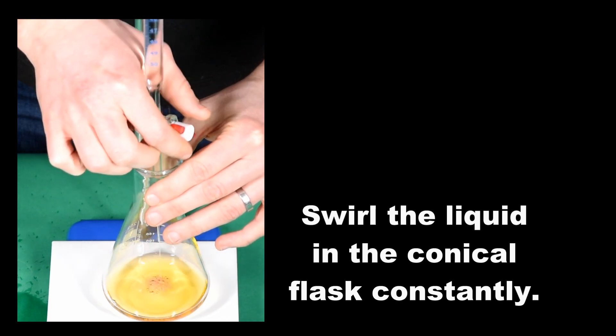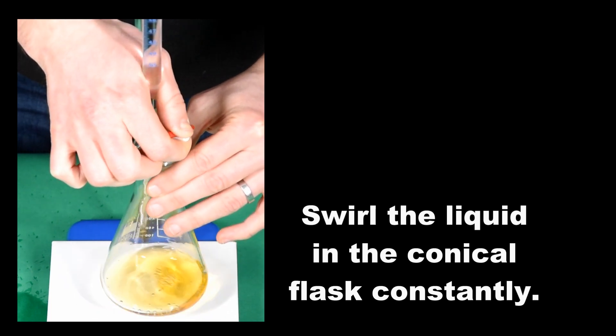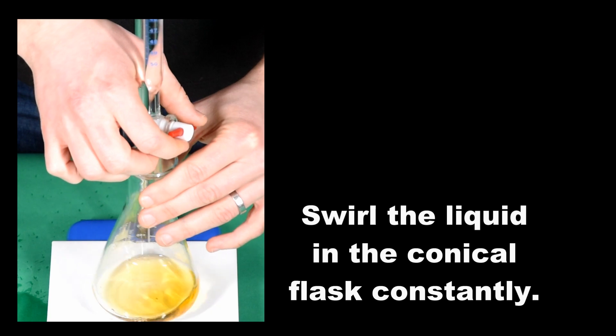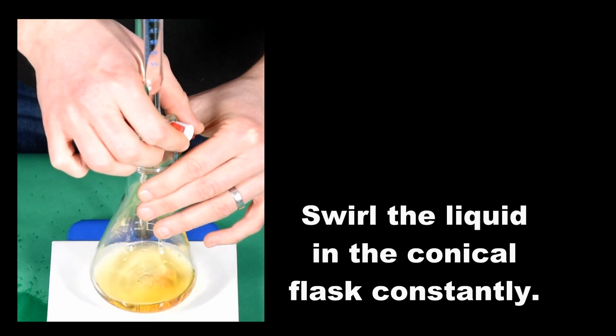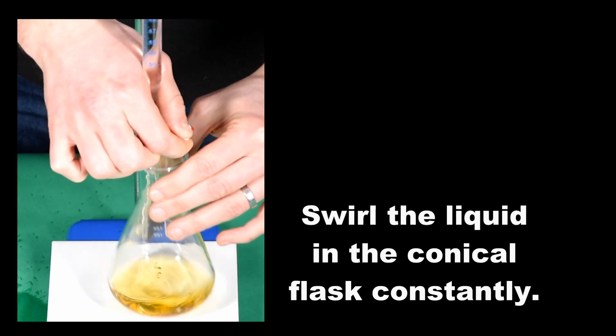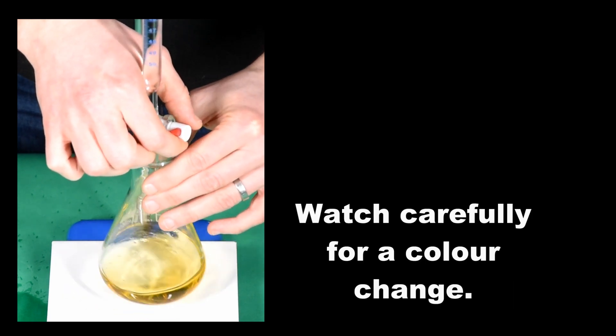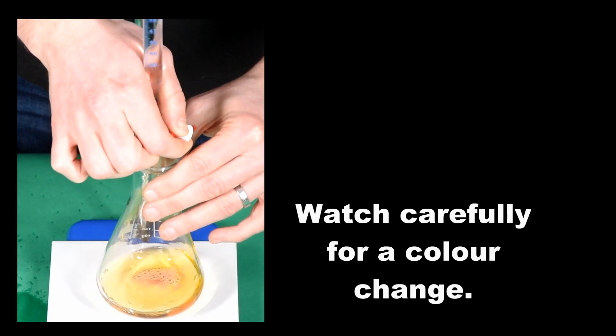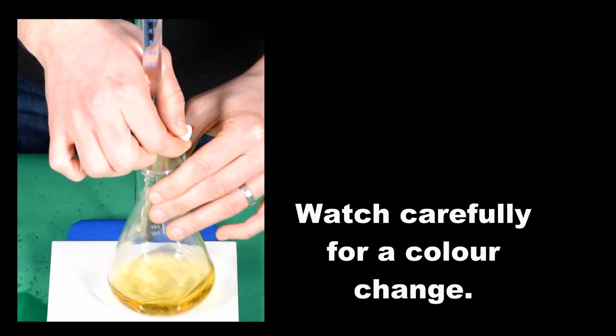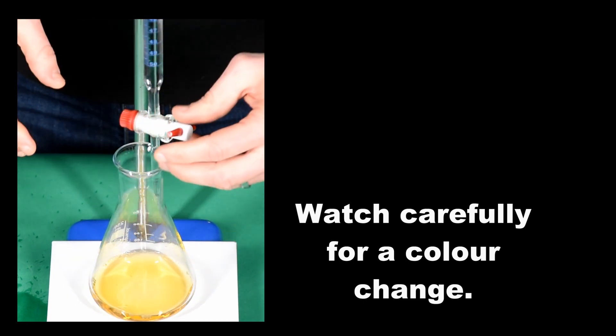Just as an aside, you can tell that the person doing the titration is a chemist by the way he grips the tap. Older burettes had ground glass taps, and they had a habit of falling out. So, you control the tap from the wrong side, if you like, in order to stop the tap from falling out. And with modern burettes, it means you're less likely to break off the end of the glass.